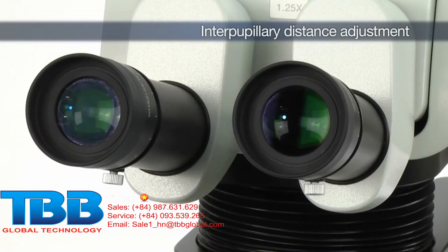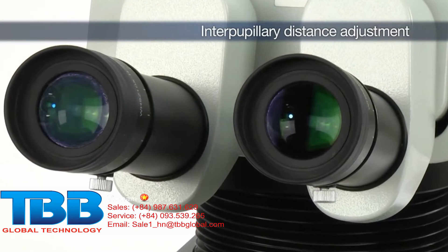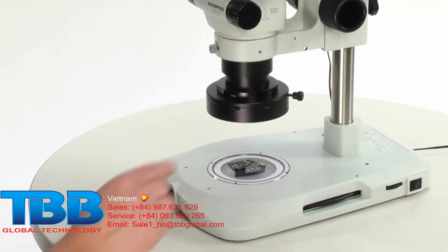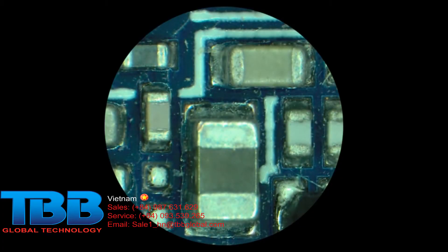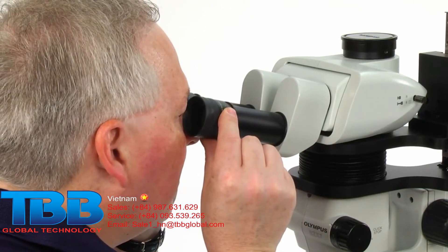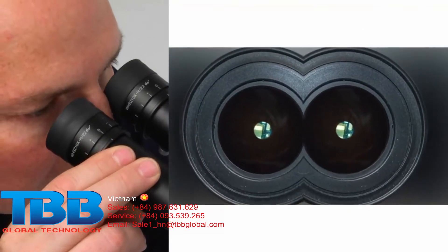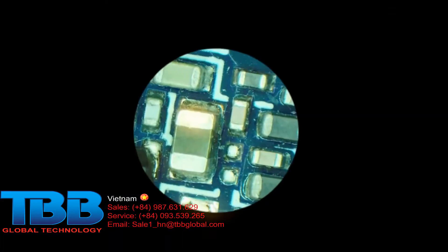Adjusting the interpupillary distance is necessary to obtain proper binocular vision. First, place a flat sample on the stage. Adjust the lighting and bring the sample into focus. While holding the left and right observation tubes with both hands, look through the eyepieces. Adjust for binocular vision by moving the eyepieces together or apart until the left and right fields of view merge to form a single image.